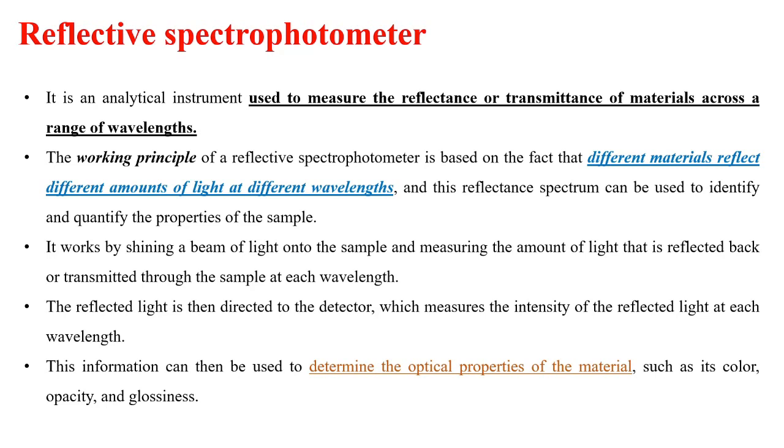Now coming to the working principle of reflective spectrophotometers, it's basically how the light is reflecting from an object. If you are seeing a green object, I think if you have studied optics, which light is it actually reflecting? Can anyone tell? If it is green, leaves suppose. Absorbing all and reflecting green. Exactly. So based on that reflection, we can predict the color of any object or any kind of sample that we are given, right?